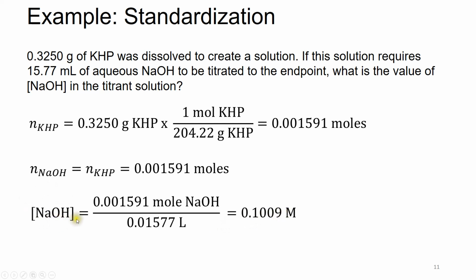And then we'll use this sodium hydroxide solution to titrate the acetic acid solution. So again, 2 steps. We determine the concentration of sodium hydroxide first, and then use this solution to titrate acetic acid.